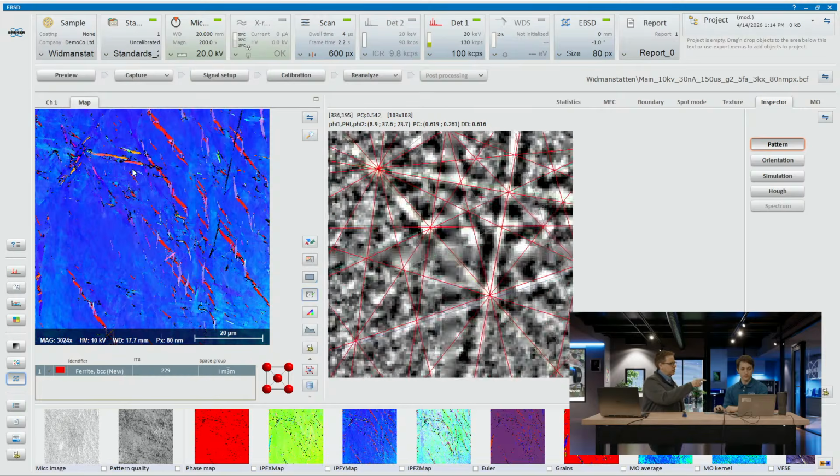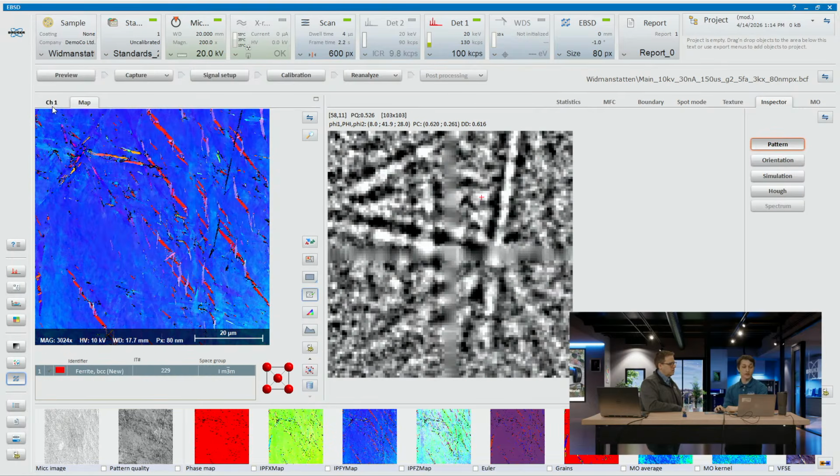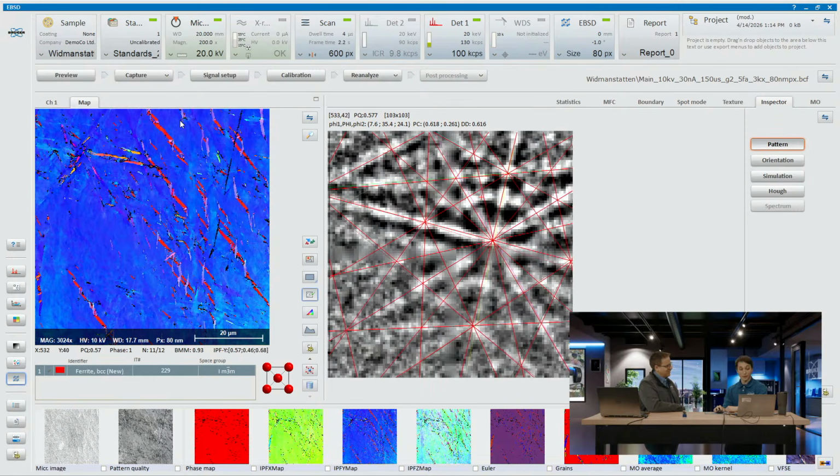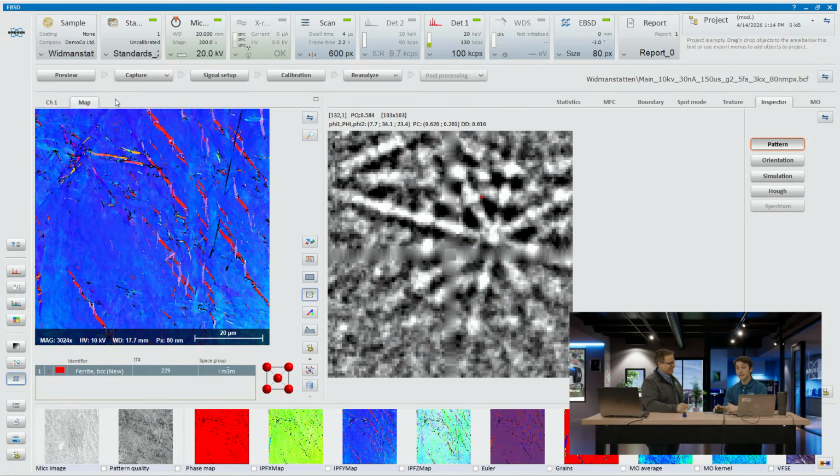Okay, so that is the normal image that you get off of an SEM? Exactly, yeah. And then when you switch it, now we see the EBSD image. That's right, yeah. And that's a lot more interesting, I would say, than the composition data. Yeah, and indeed the secondary electron image too, right? Maybe I saw a little bit of different topography before. Right. I could see some different characteristics of the sample surface, but I don't really know what's going on in the sample. Right. I mean, this isn't anything outlandish metallurgically either, because it's very common when you have a rapidly quenched material, you're not going to see a compositional difference. But structurally, it's going to be quite different.